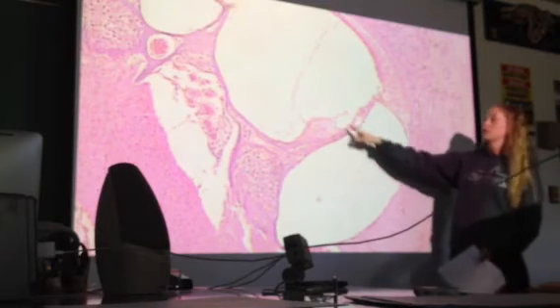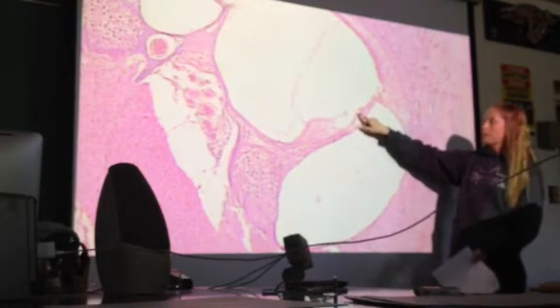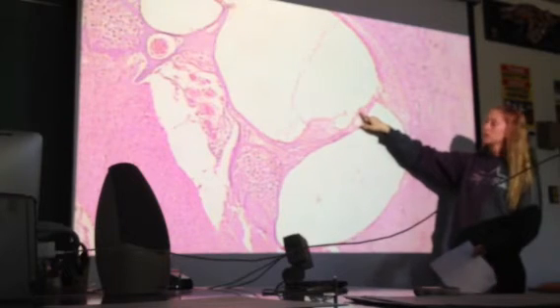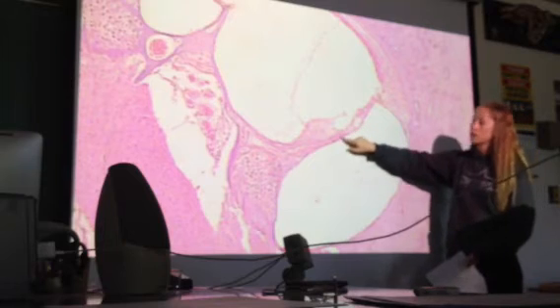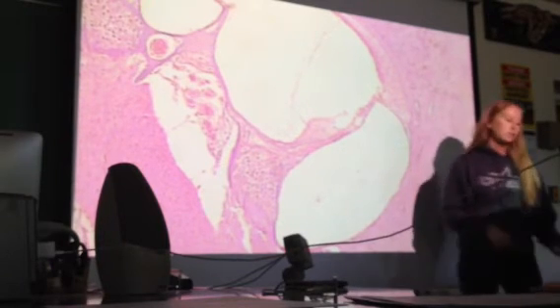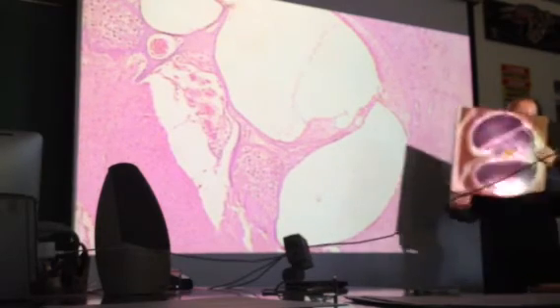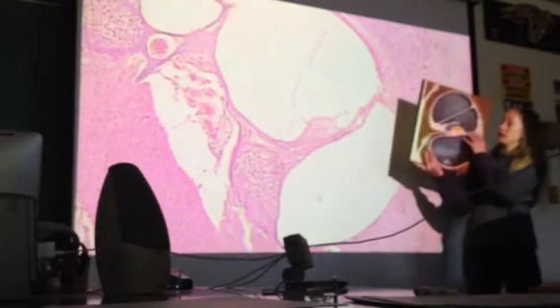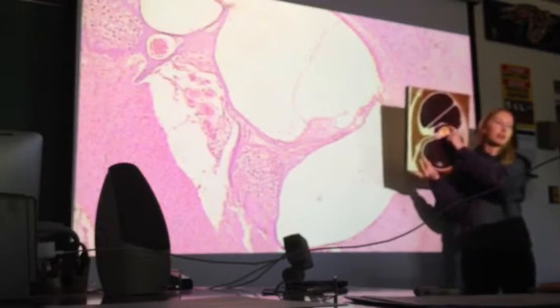Okay? So here we have our tectoral membrane. If you follow that down, there's going to be a bump right there. That is the hair cell section. And then the basilar membrane is just this lining of cells on the other side. Now, it's actually just my favorite example of an organa corti, so hopefully you guys can see the board also. If you look here, the tectoral membrane really perfectly overlays this bump that are the hair cells.